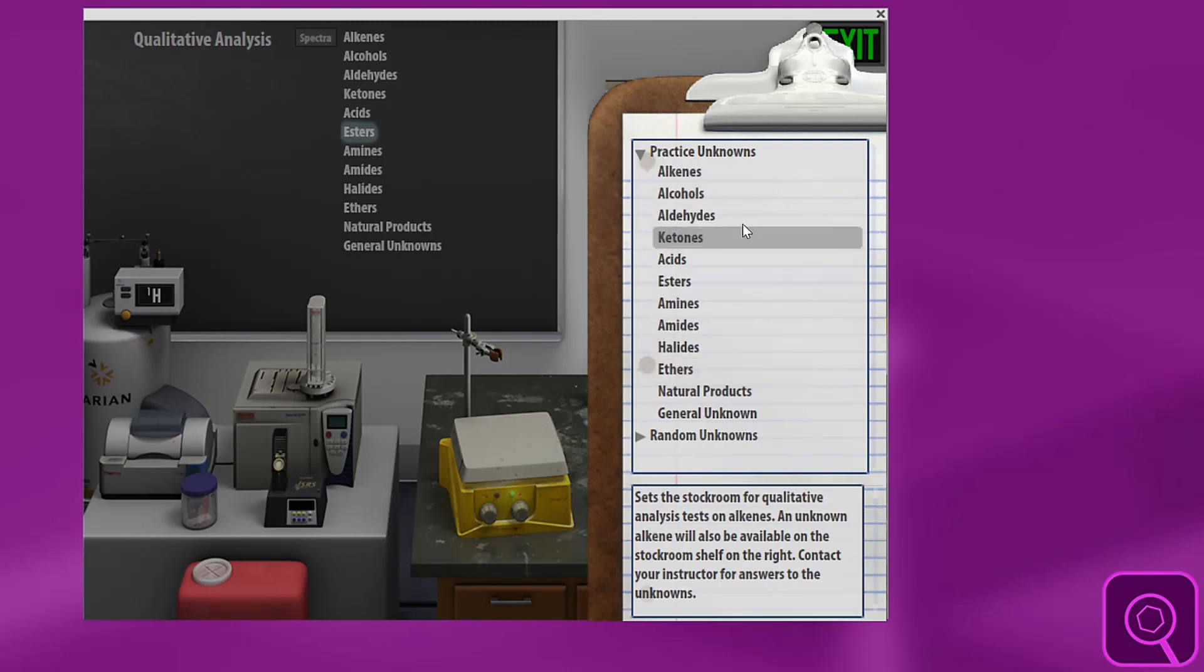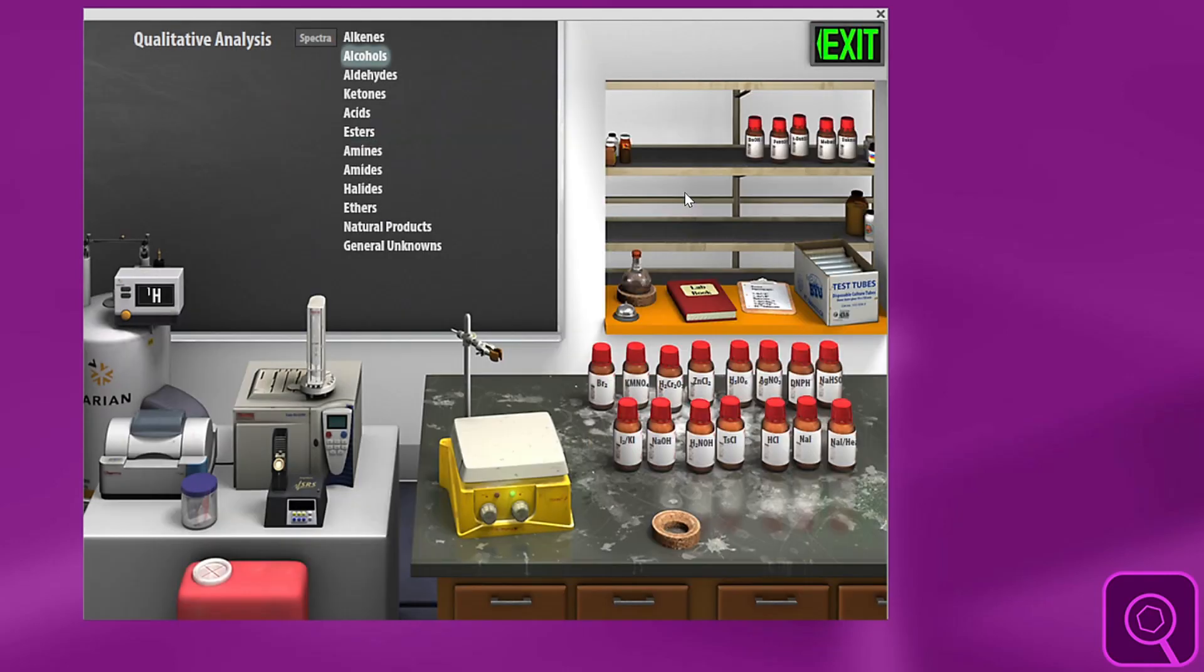Practice unknowns are split up into functional groups. You can just click on a functional group and then on the shelf will appear an unknown with a number on it. You can look up these numbers in your answer guide as an instructor, so the student will perform all the tests they need to do, determine what their unknown is, and then report that to you.